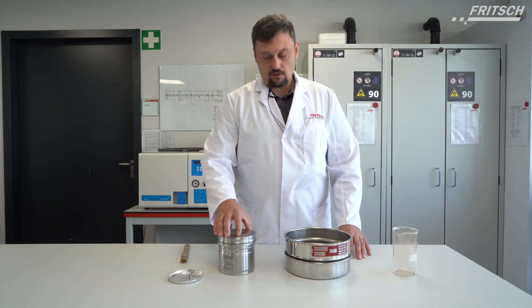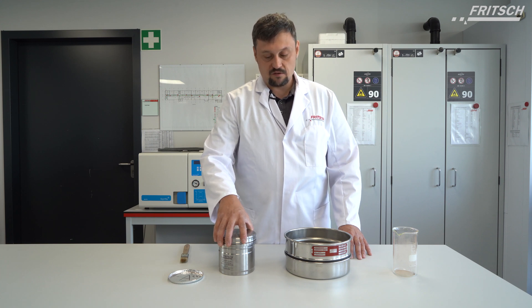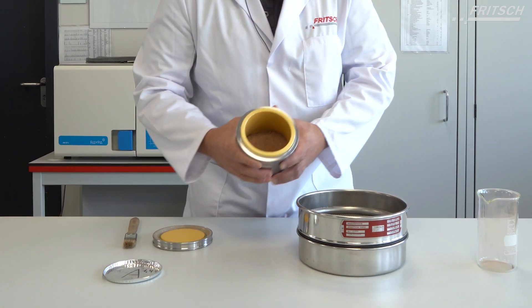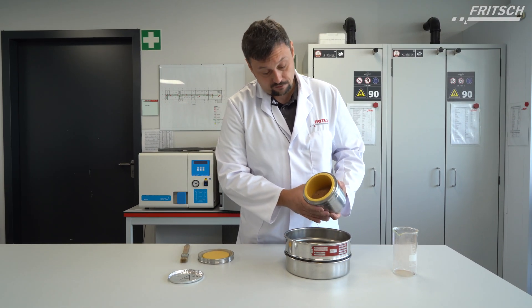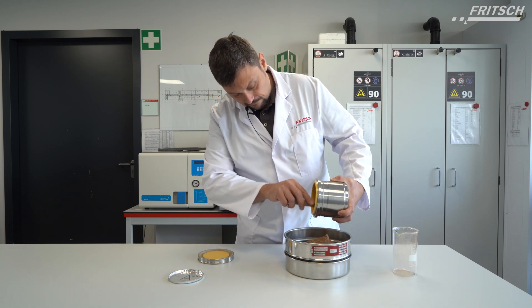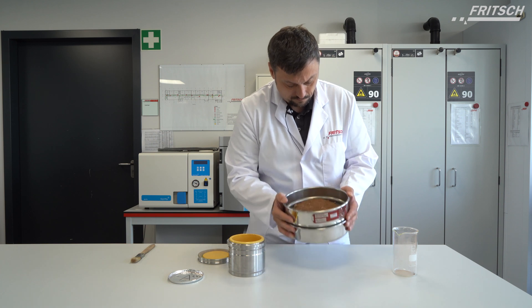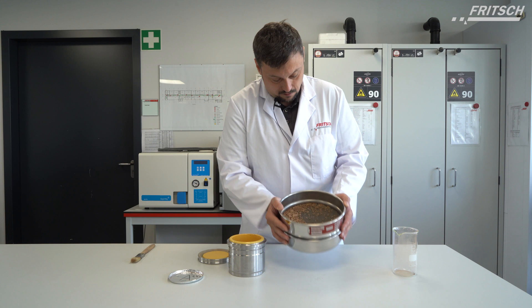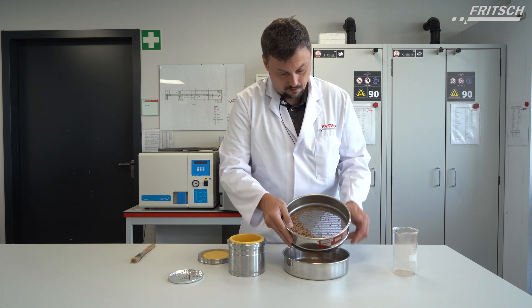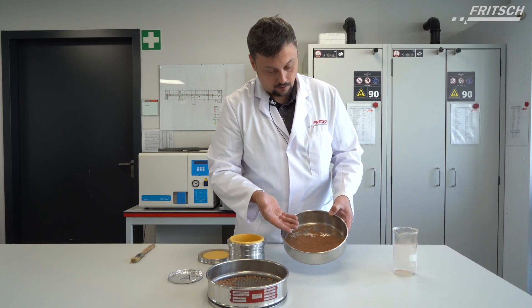Now we want to see the result of sample A with the test of 450 rpm without balls for one minute. As we can see, the sample is very fine. We want to test how much of the sample is above two millimeters. I think there should be a lot of clay in this sample.